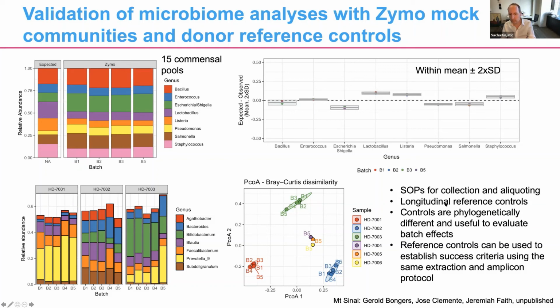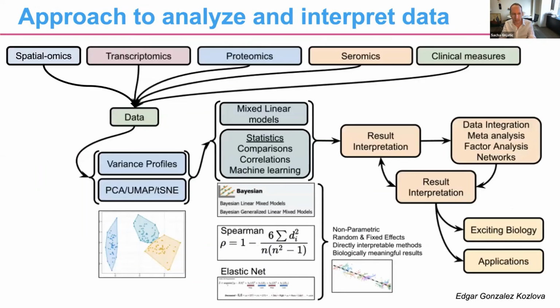So these are SOPs that are all present on the website that Ignacio mentioned. And with these longitudinal reference controls, we hope to be able to continuously compare our different platforms between MD Anderson and Mount Sinai, the 2 sites participating.